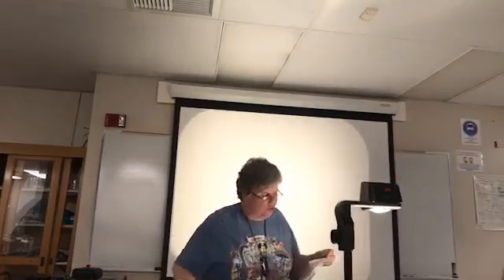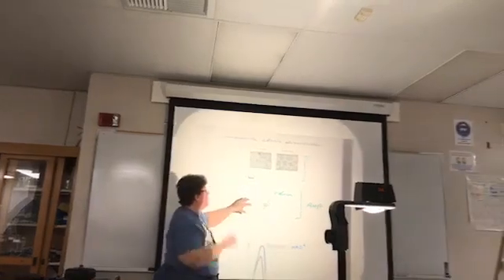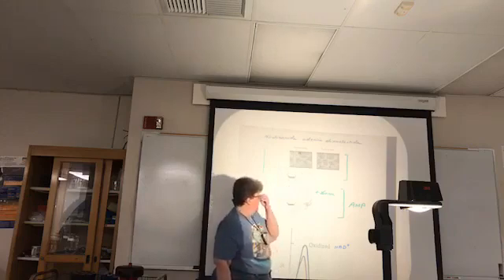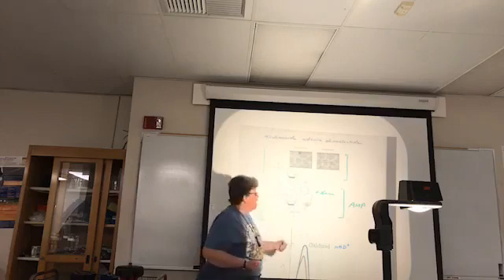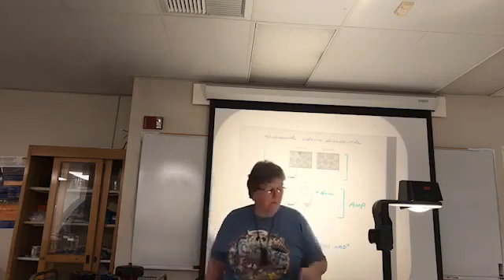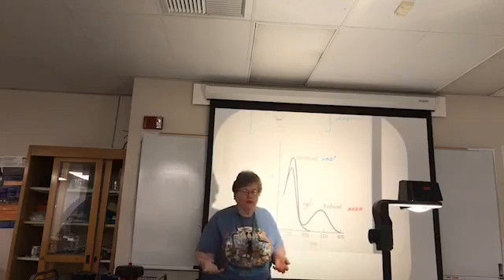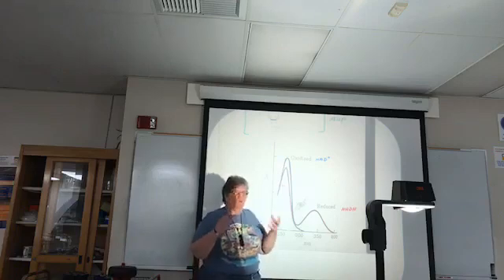So let's talk about the actual basis for the experiment. And this might be a little hard for you to see, but this is basically NAD and NADH. So up here you have the reduced form, NADH, and here you have the oxidized form, NAD. And it's that difference between the two that is making the monitoring of this reaction possible. Now, the AMP part of the NAD has an absorbance at 260. So for both forms, NAD and NADH, you have very high absorbance at 260. So even though you might say, well, why aren't we using the peak absorbance for our NAD or our NADH? It's because while there is a small difference between the two forms at 260, it makes it very difficult to tell which form it's in.